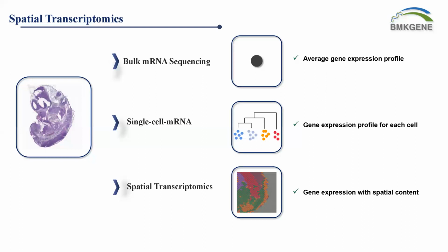So there is information missing in this step, which is the spatial content. And the spatial content actually is very, very important in many biological arenas. So spatial transcriptomic studies help us give this gene expression profile, and at the same time, it saves the spatial content for us.